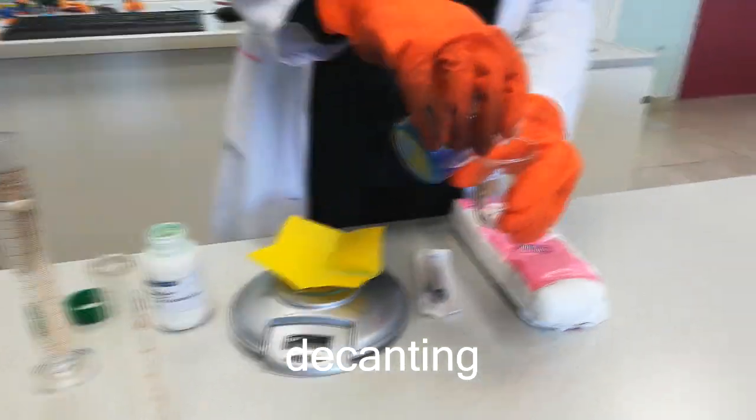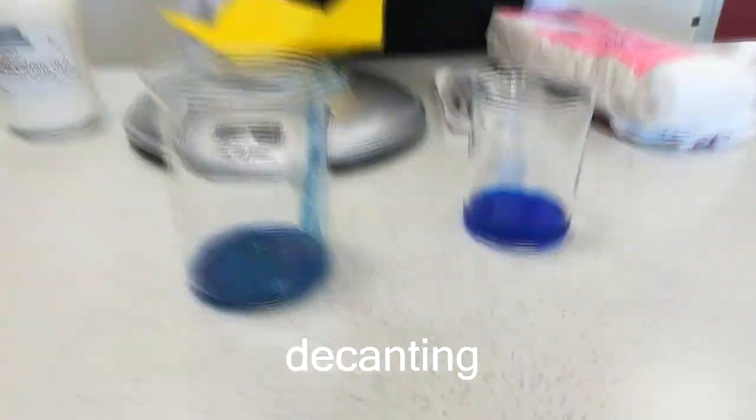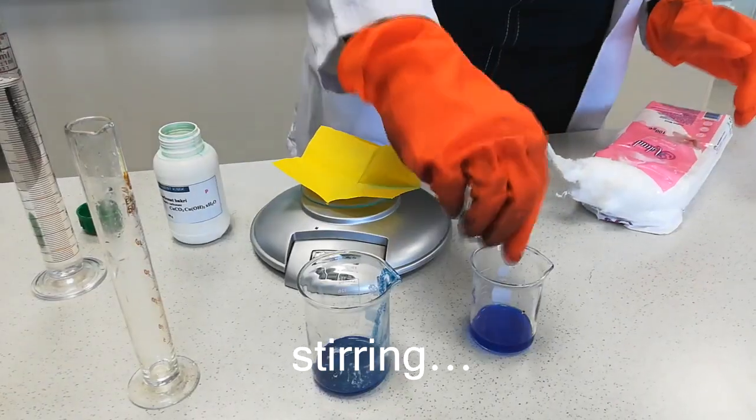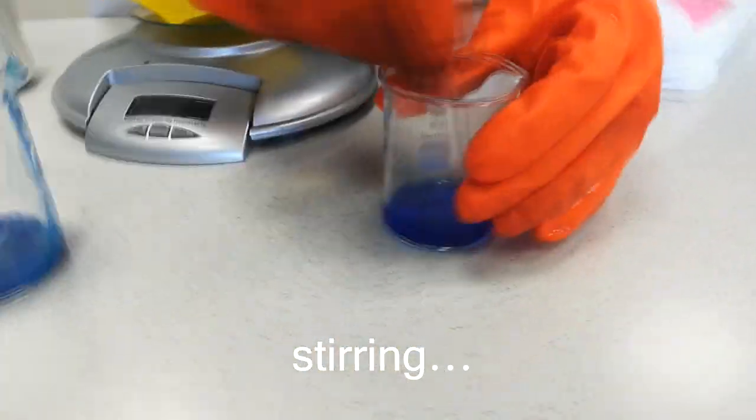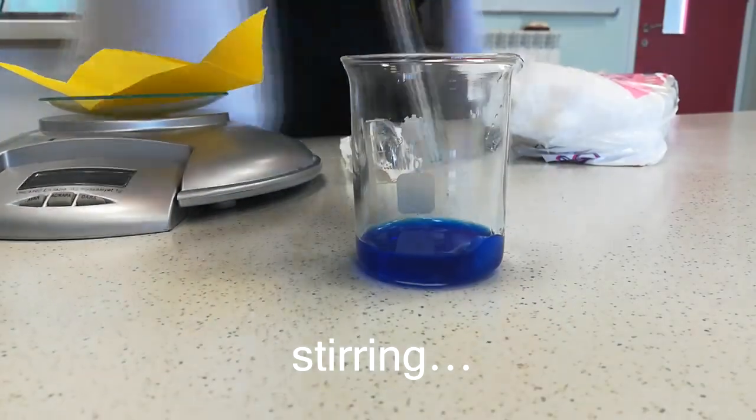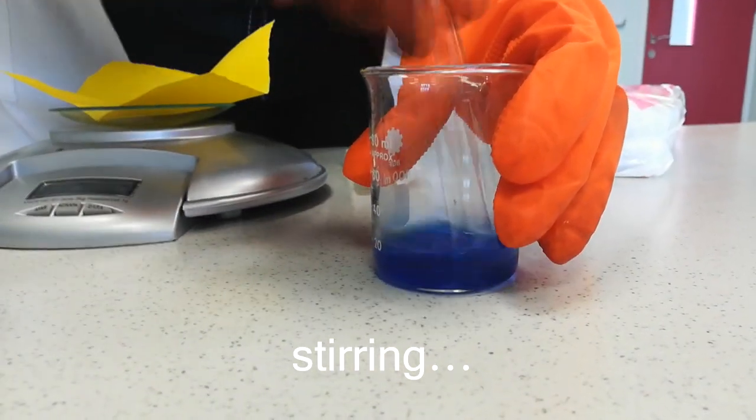Since a precipitate will form, we then decant the solution into a second beaker. After that, we add bits of cotton wool slowly while stirring until the solution becomes viscous. Stirring continues until there are no or few lumps left in the solution.